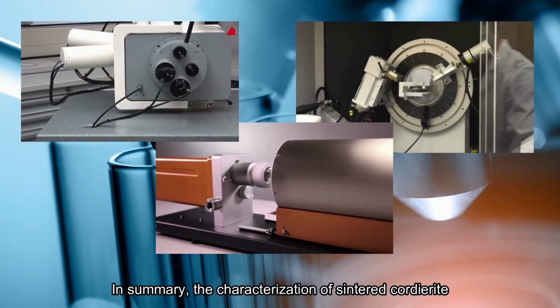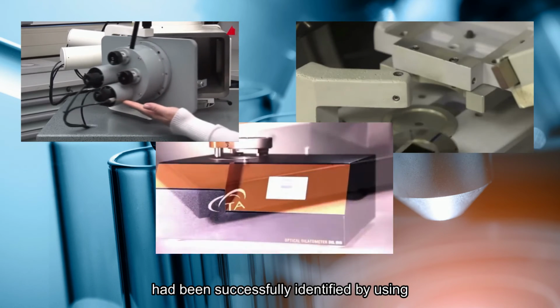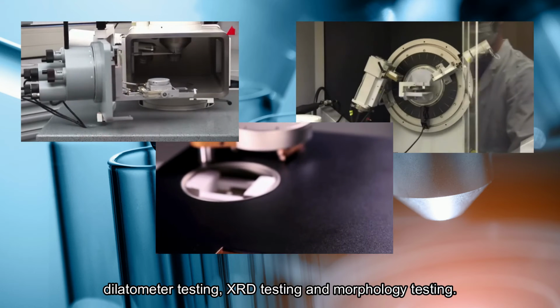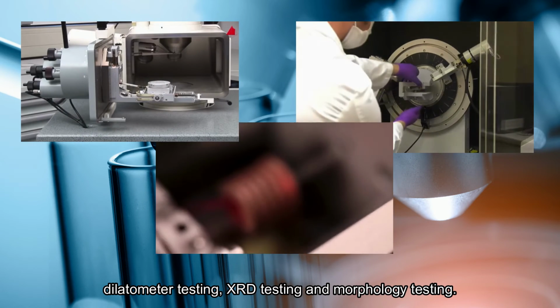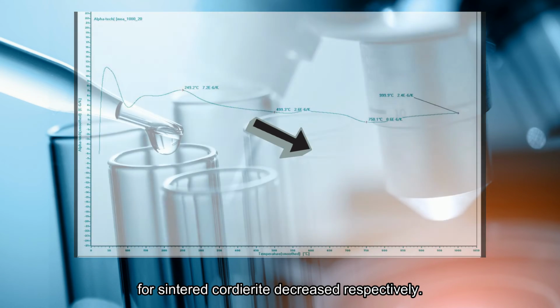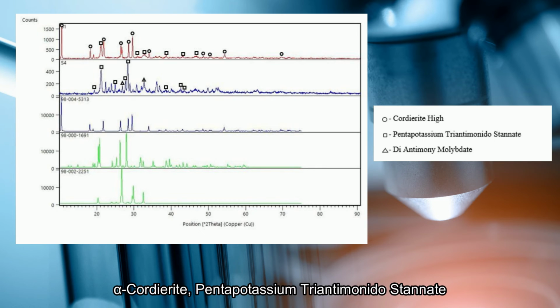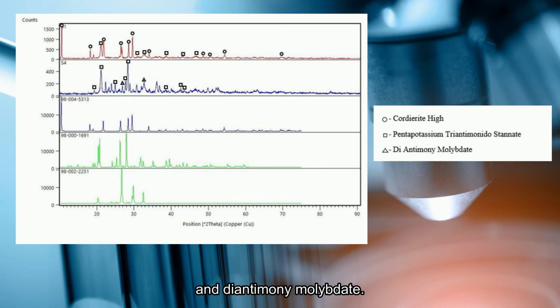In summary, the characterization of sintered cordierite had been successfully identified by using dilatometer testing, XRD testing and morphology testing. The coefficient of thermal expansion for sintered cordierite decreased respectively. In terms of phase identification and chemical composition, the XRD result revealed that the phases that exist in sample 1 and sample 4 are alpha cordierite, pentapotassium triantimonidostannate and diantimony molybdate.